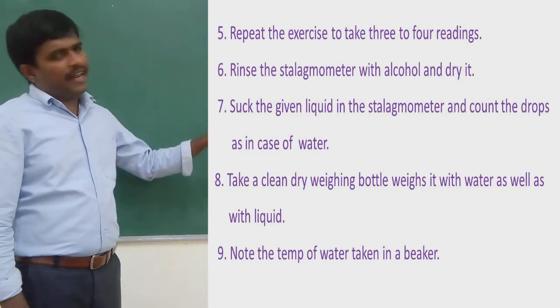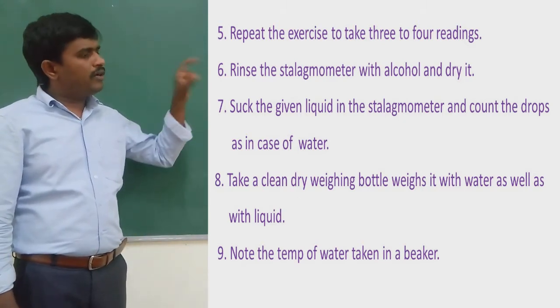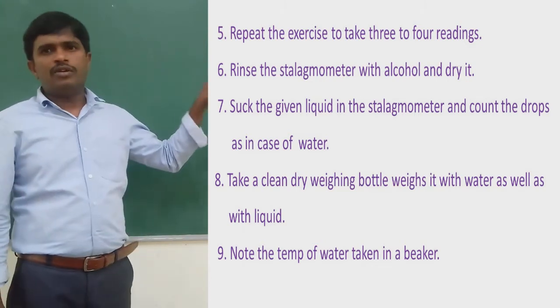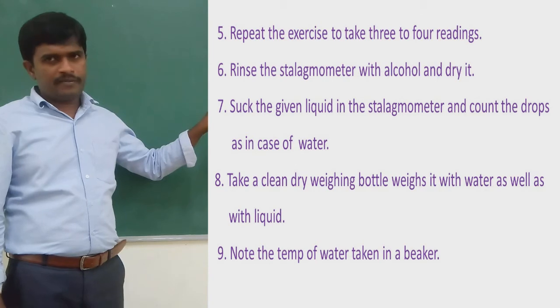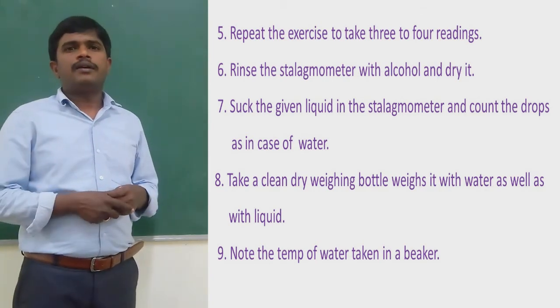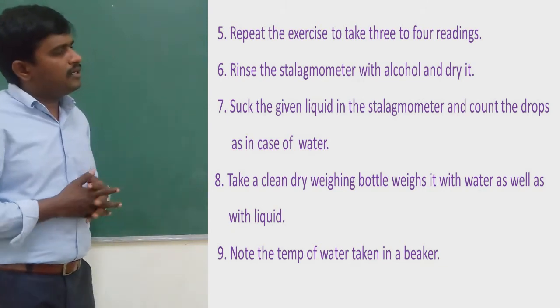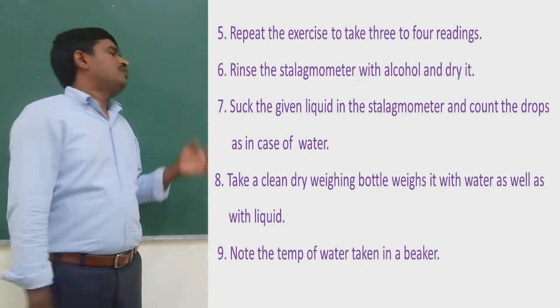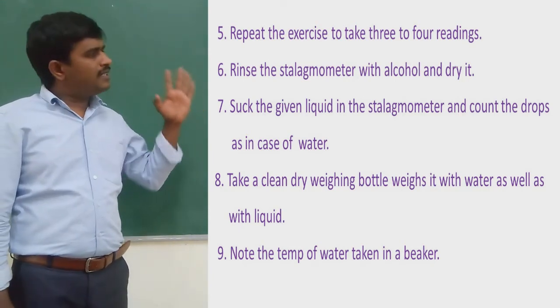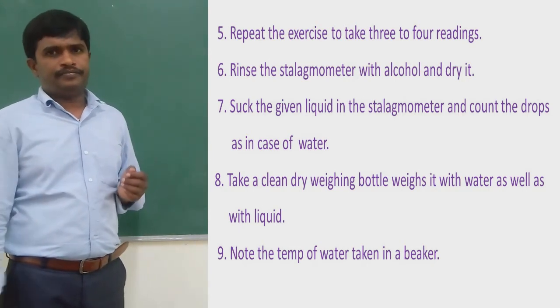Take a clean, dry weighing bottle, that is a specific gravity bottle. Weigh it with water first as well as with the liquid. And in this experiment, you should note the temperature of the water taken in a beaker.